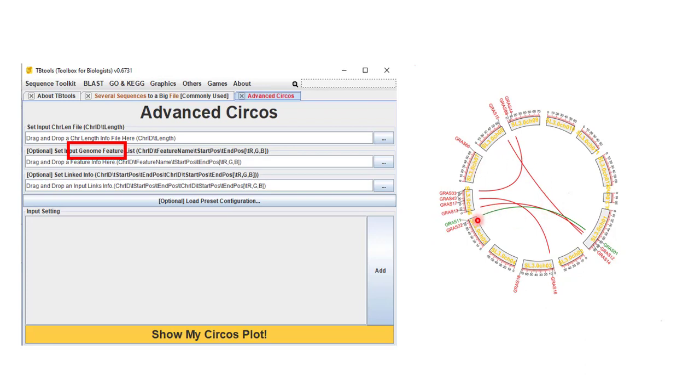So now this time the gene names appear, and if you name with different colors, then the different colors link and the gene names will appear. Like here I give the green color to the gene 11 and the gene 01. So both of these genes become green and their link also becomes green, while the remaining remain red.